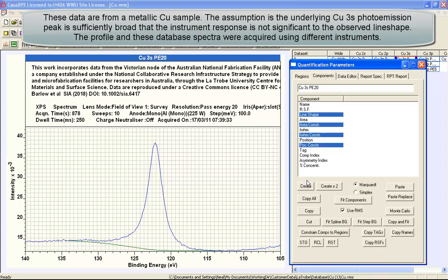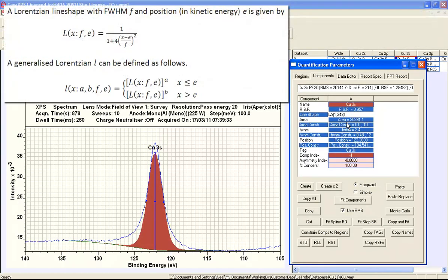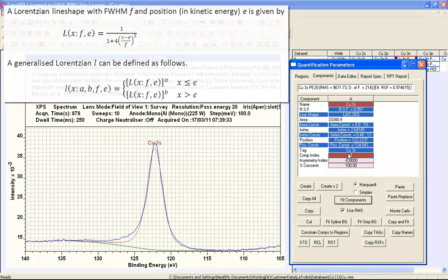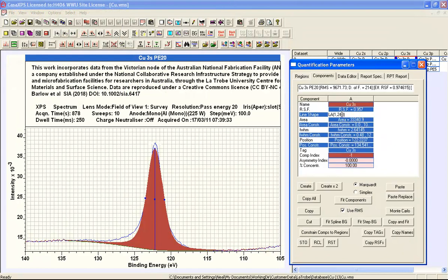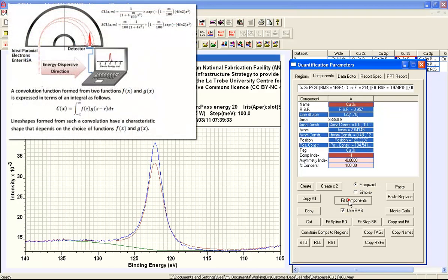And we can get an idea of what this might look like if we introduce a line shape that is very Lorentzian, an LA(1,243). Let's try fitting these to the data, and then reducing the amount of Gaussian broadening. So now let's make that 70, say, and say fit.